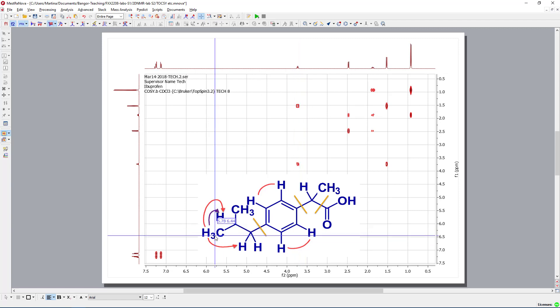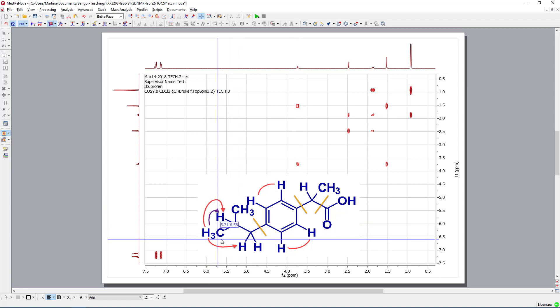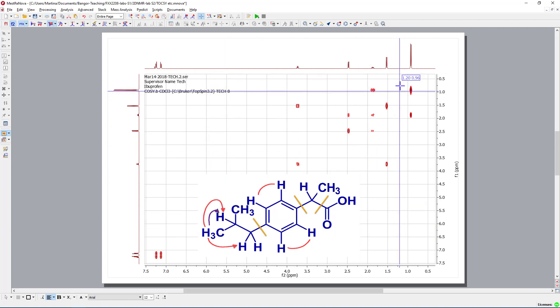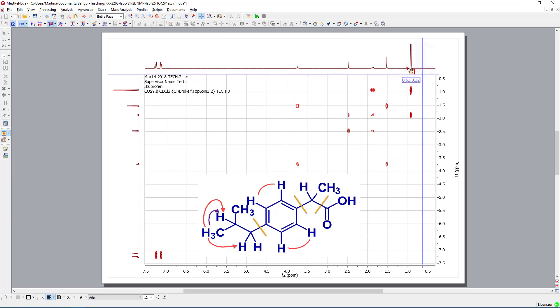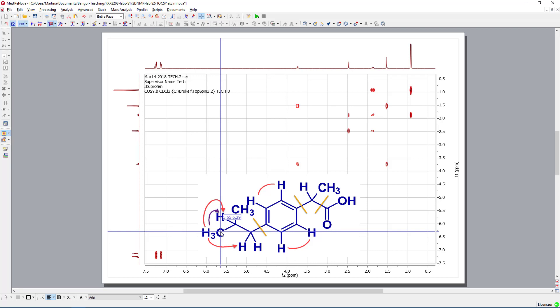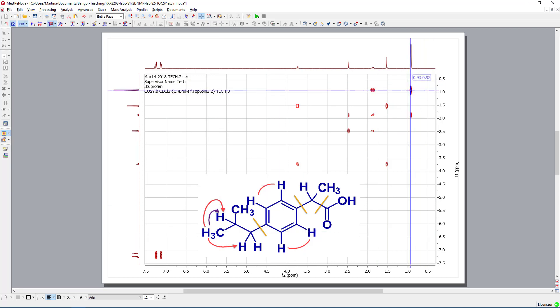So, again, we wouldn't expect a big difference between the COSY and the TOCSY. However, there would be a small difference. Let's have a look at this methyl group, or one of those methyl groups. They are placed here around 1 in my COSY spectrum. This signal is obviously correlating with itself.